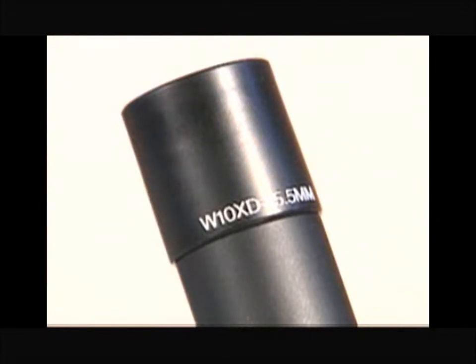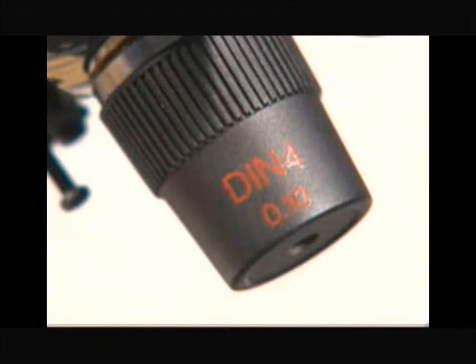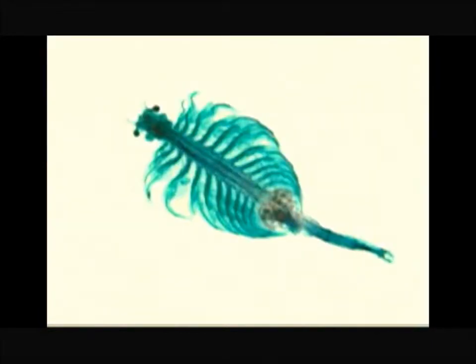When you combine a 10-power eyepiece with a 4-power objective, the overall power or magnification becomes 40. This is a brine shrimp magnified 40 times. At this power, you can get an overall view of an object.